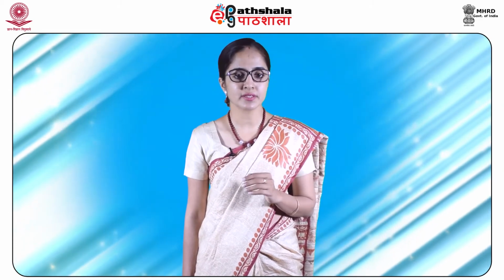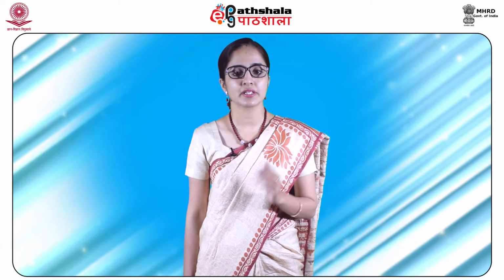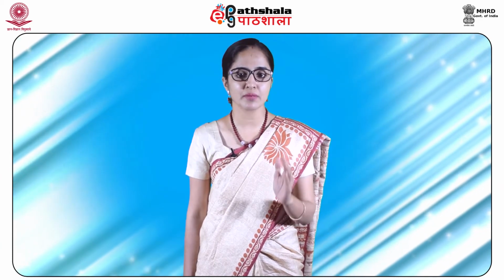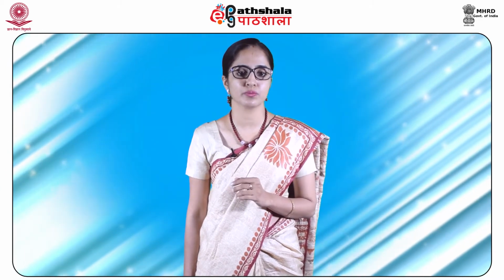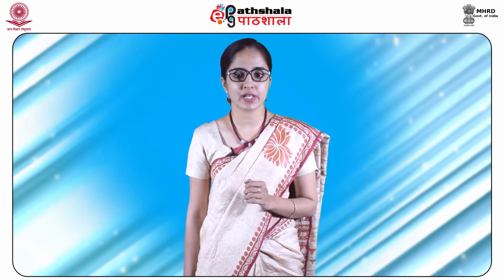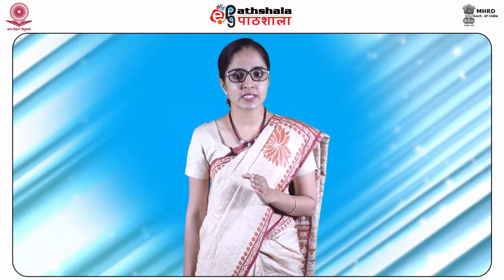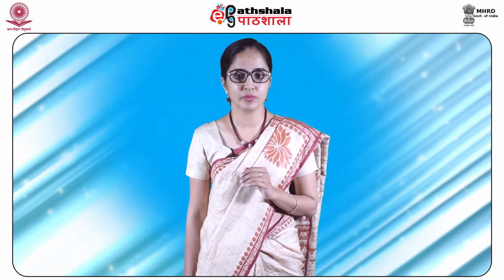Now students, let us learn about the number of signals, that is chemical equivalence and non-equivalence, and how many signals they give rise to. The number of signals in a proton NMR spectrum indicates how many different kinds of protons are present in a molecule.